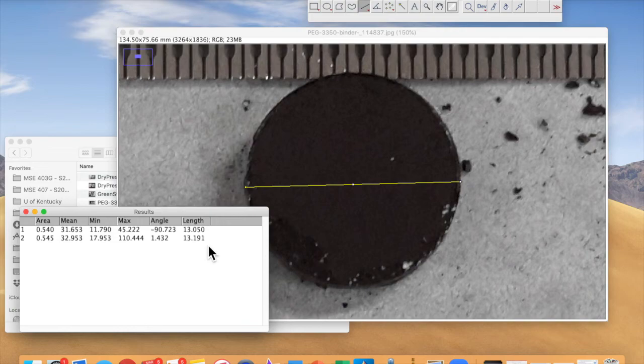You'll also have different teammates doing this lab as well, and so they'll get different measurements taken, and so you can give it an average diameter or average thickness of what you have. But again, keep in mind that there's going to be error along the way with the device you have, so the ruler, it's only going to be as accurate as the ruler that we have, and also you're making these lines, so there's error associated with how good the image quality is, and so forth. But that's how you process, and that's how you get the lengths that you'll need for these pellets.